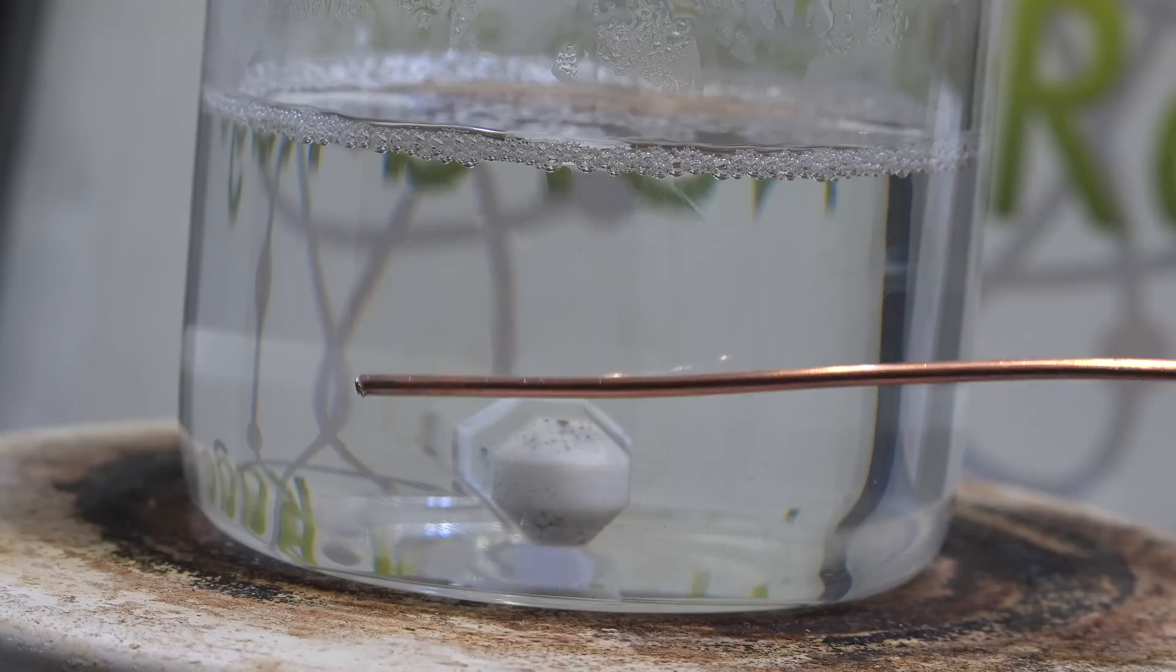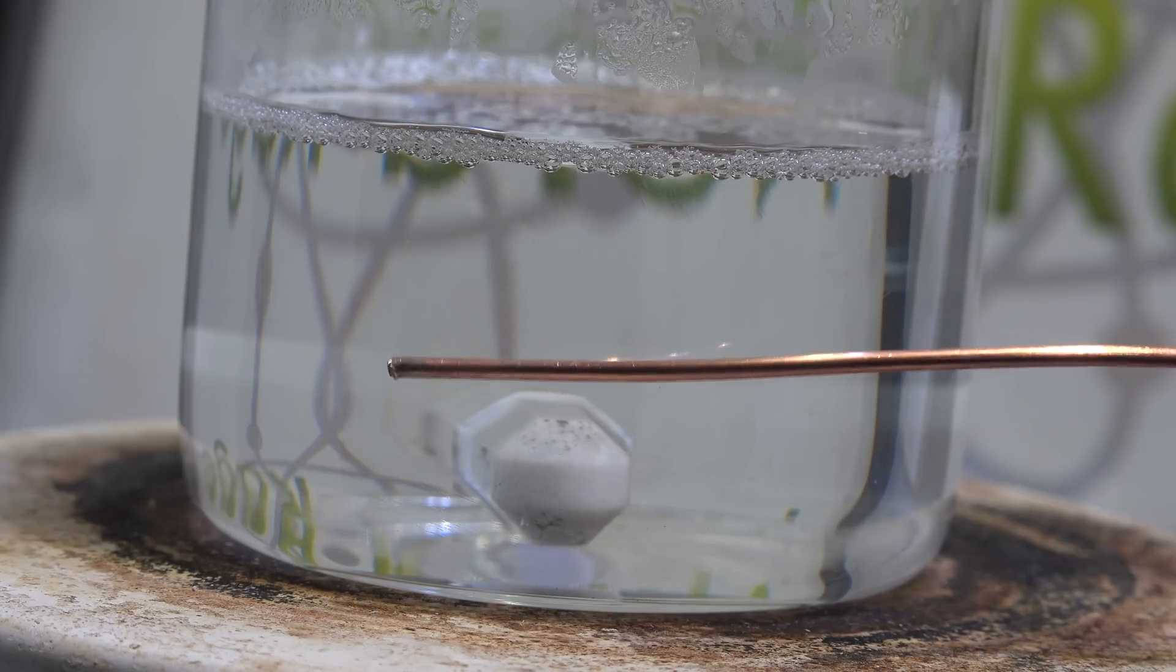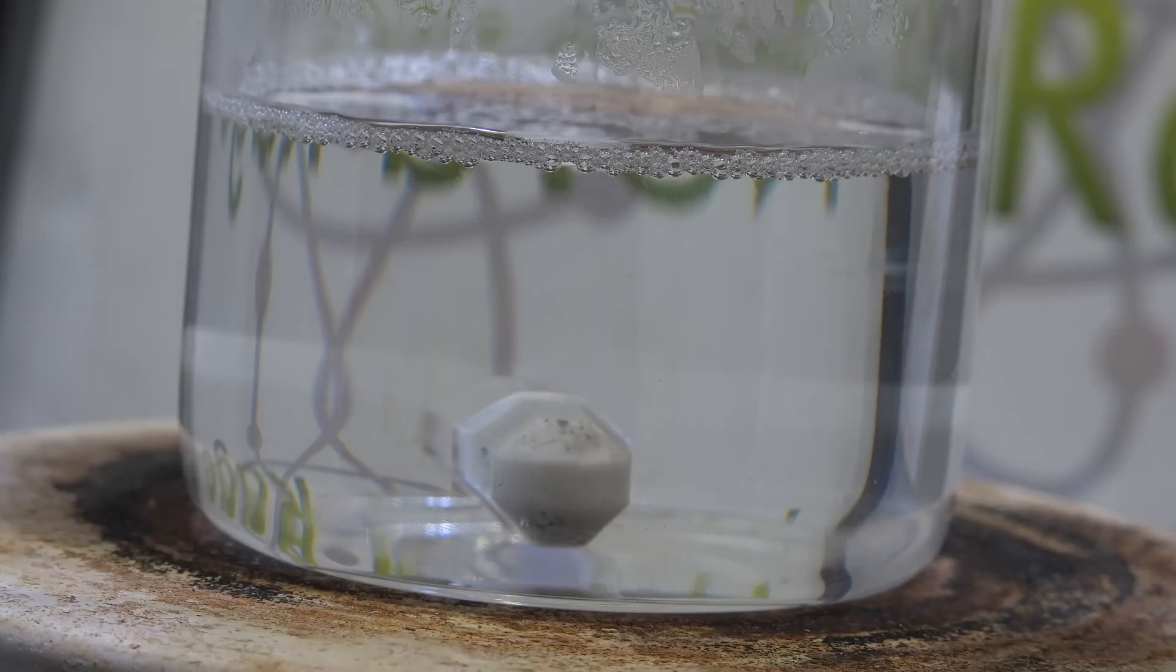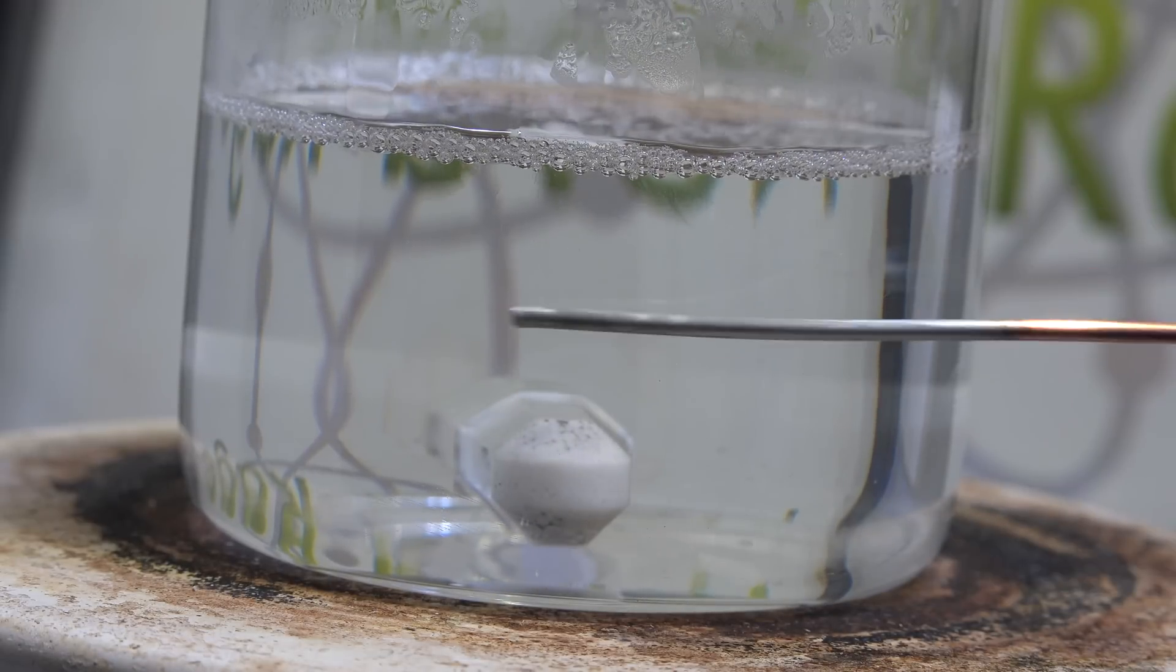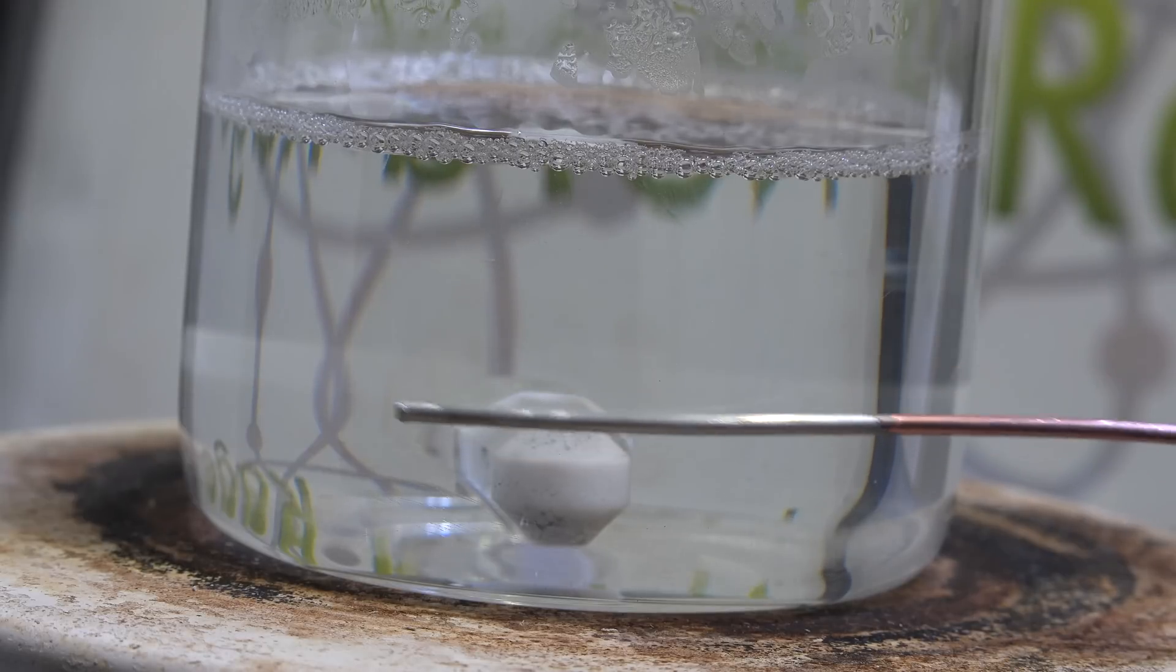Now for the fun part we put in some copper. I'm going to put in this copper wire. Now remember before that tin did not plate onto copper from tin chloride. However we now have a nice smooth layer of tin.